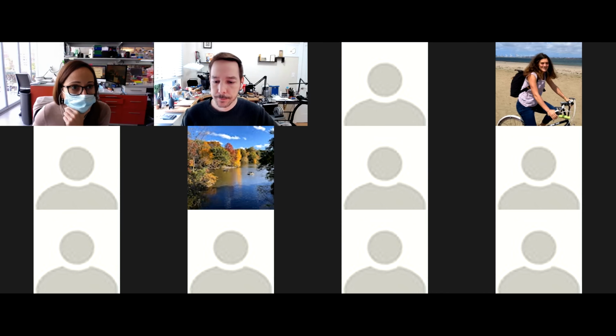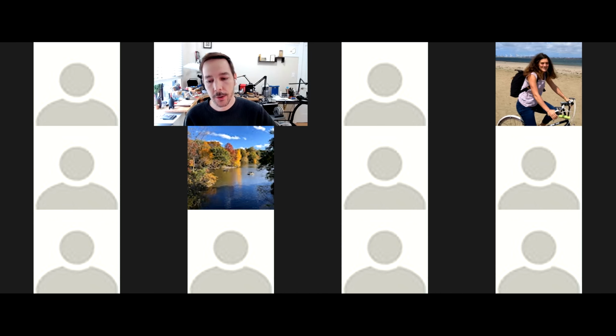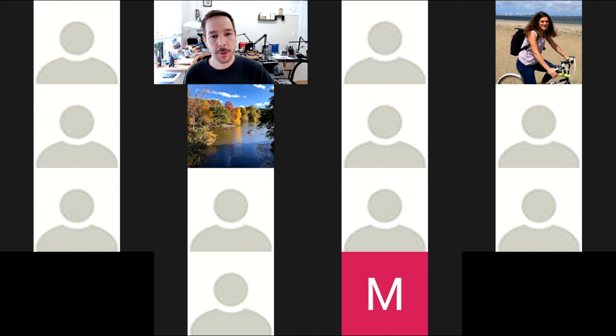Before we get started, just in case you're not using automated techniques for image analysis, I think it's a really important thing to think about doing. I think many of you have probably had projects where you've had to count cells or endosomes or something in tissue, and it's very tempting to, maybe you try briefly to do it automatically, and you have a little bit of trouble, and so you just revert back to doing things manually. And there's a lot of pitfalls in doing that.